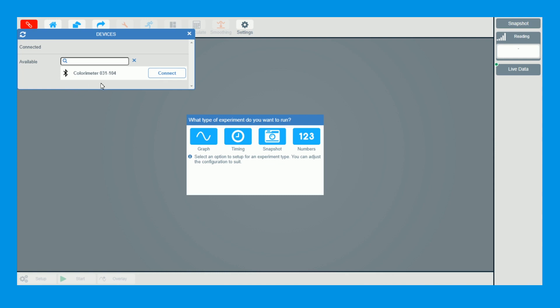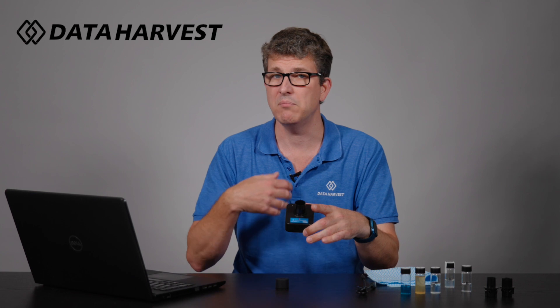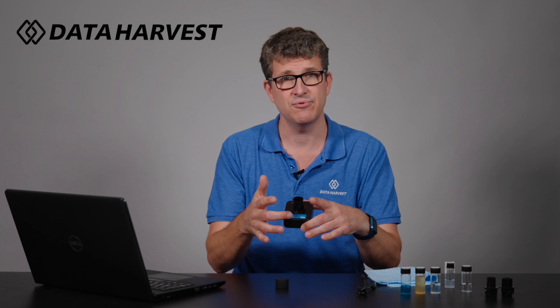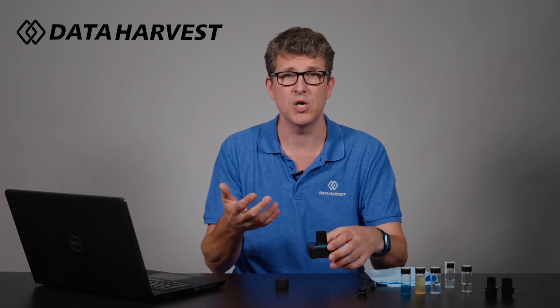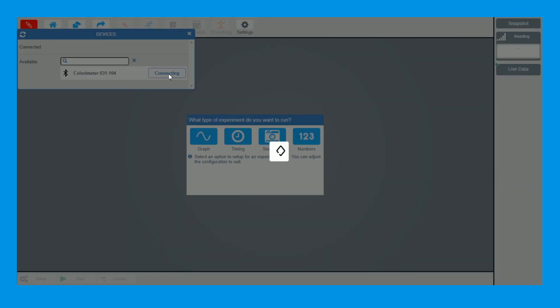To start off, I'm going to open the EasySense 2 software and go to Devices on the top left. There is a six-digit number on the front of the wireless sensor. If you have multiple wireless colorimeter sensors in your classroom, each one will have a different six-digit number so students will know which is theirs. I'm going to click on this one finishing 104, which is this one just here.